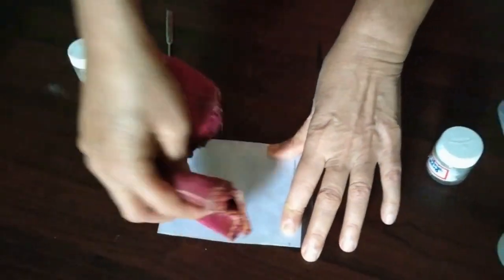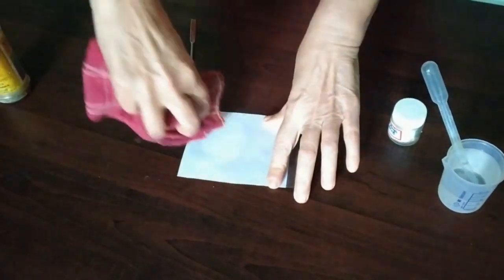There is no need to spend time. Just wipe it off. Now the sheet is ready for the next experiment.